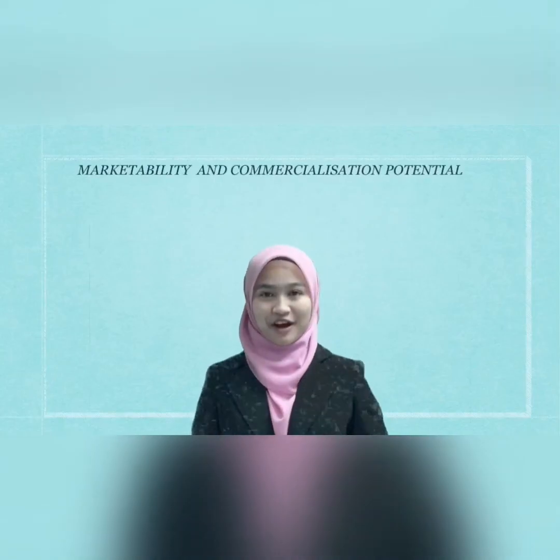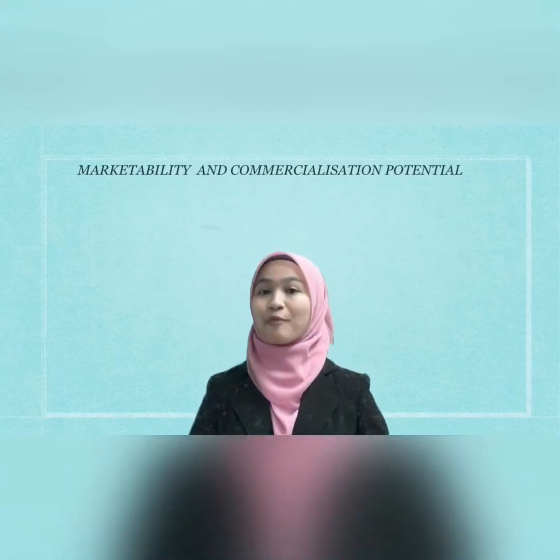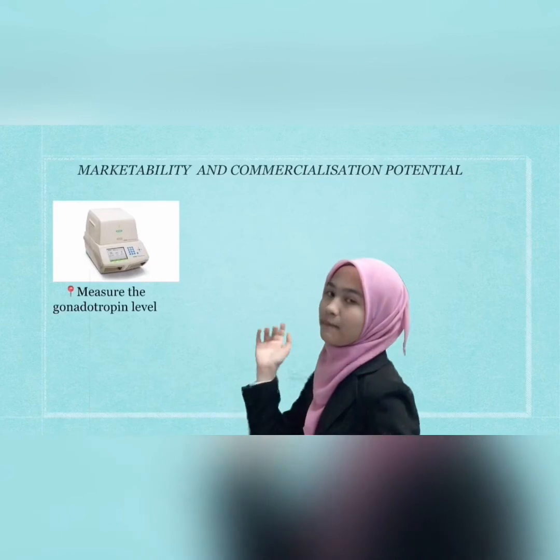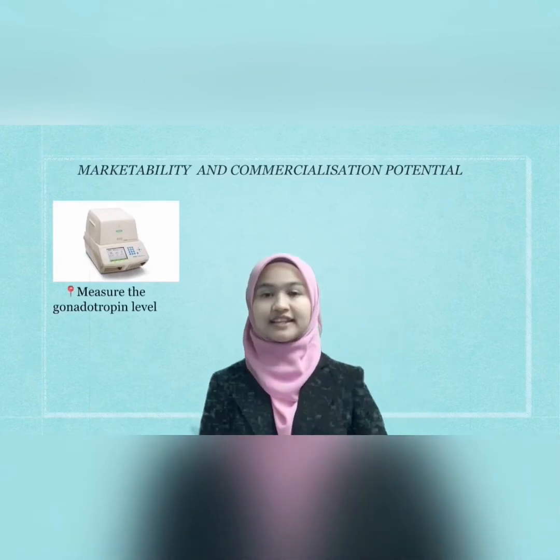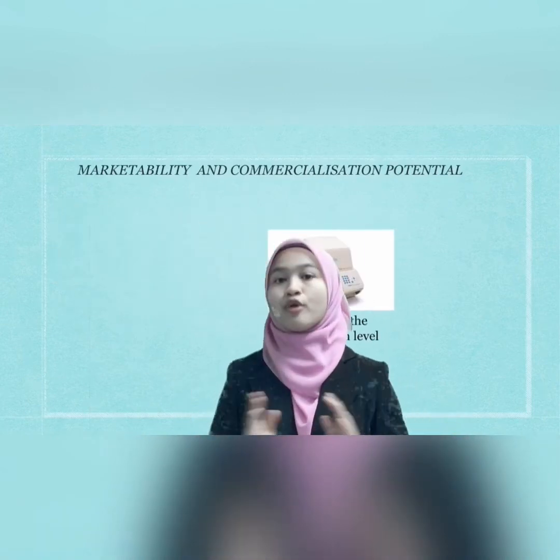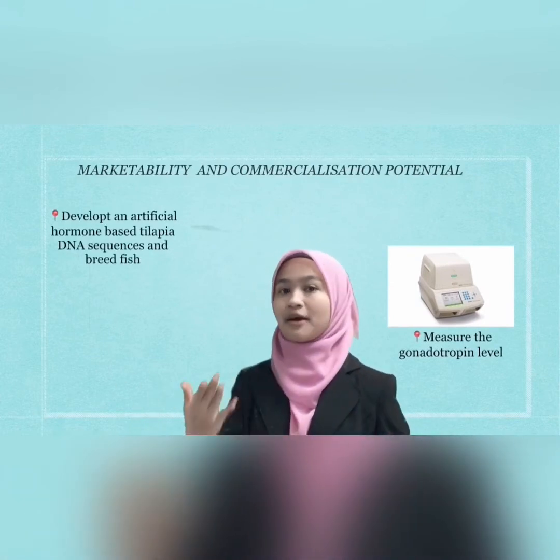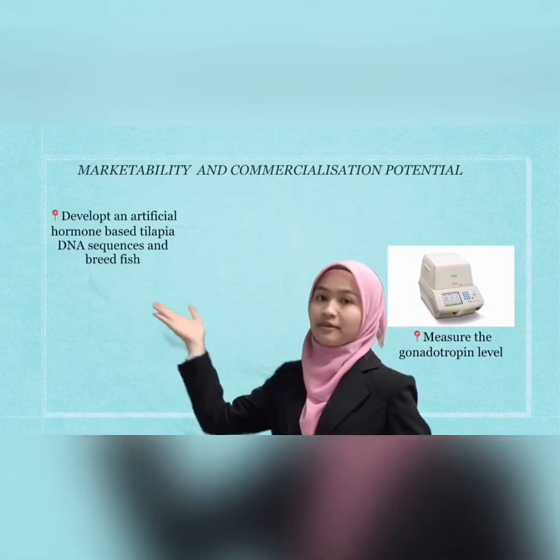As for the aspect of commercialization potential or marketability, we are using the PCR assay to measure the gonadotropin level in tilapia and other piscine species. We could also develop an artificial hormone based on tilapia DNA sequences and breed other fish.